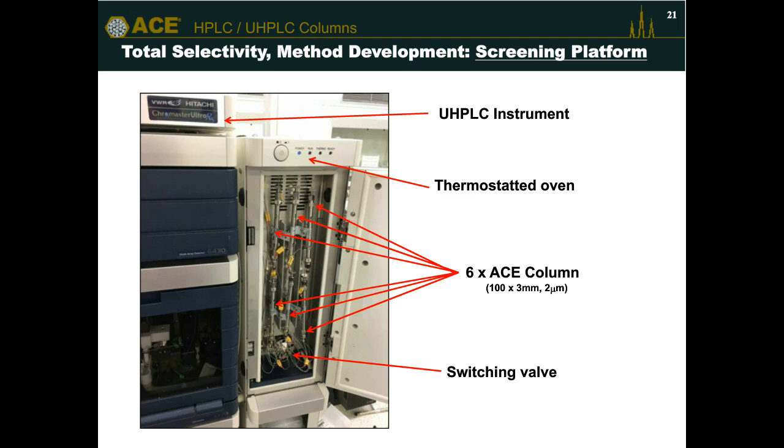Now I have a whole separate talk on method translations and how you can get a quantitative transfer of your chromatography irrespective of the column dimensions, if you use the right equations and the right tools. That's another separate talk. But yes, normally, to answer the question, we screen on this format, we develop on this format, but then depending on what the person has asked us for, we will either give them a method in HPLC or a method by UHPLC, or sometimes they don't care and they're happy with our screening format. So it depends.